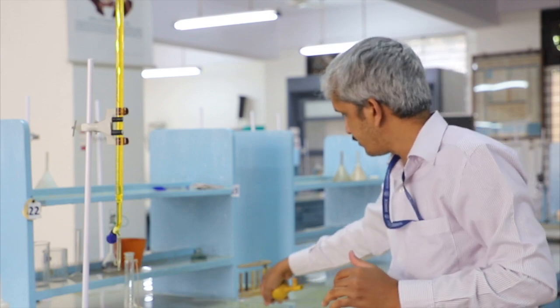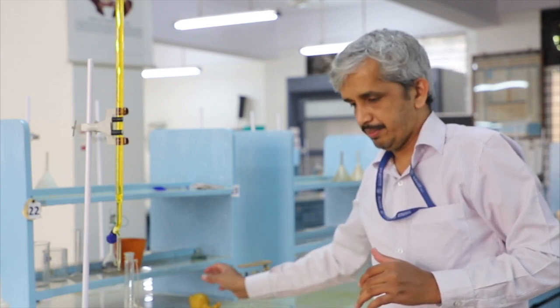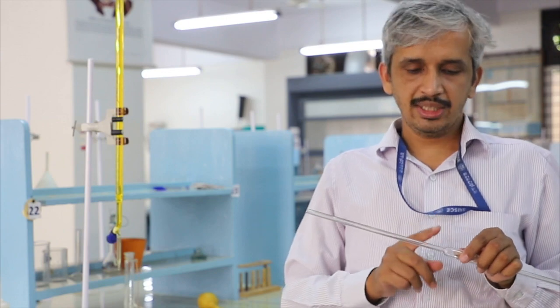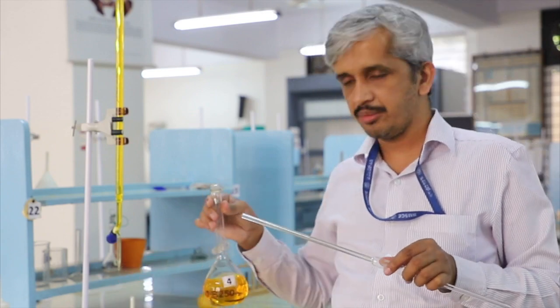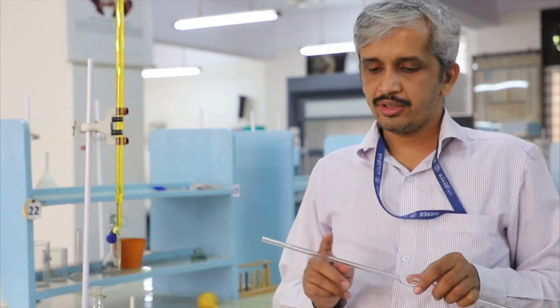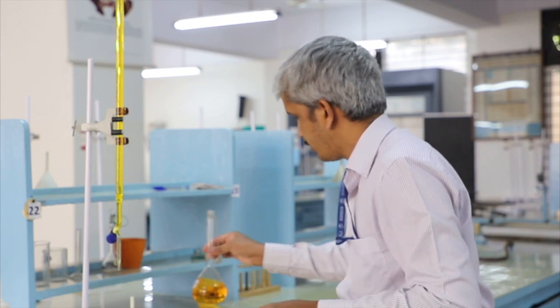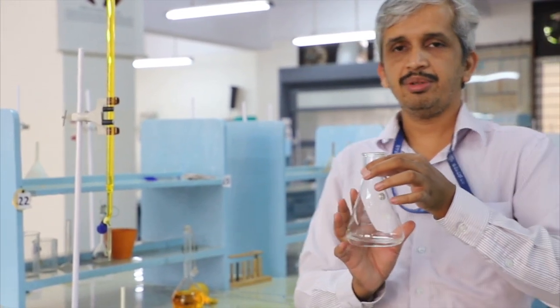Exactly the same thing can be followed for a 25 ml pipette. And the important thing in case of a pipette, the rinsing should be done with distilled water. Also, rinsing should be done with the solution to be taken. Let's say I am taking potassium dichromate in the pipette. In that case, it should be rinsed with potassium dichromate also, very similar to the buret. The important thing in case of the conical flask, the conical flask should be washed with tap water and rinsed with distilled water, but the conical flask should never be rinsed with the solution to be taken. This is the change in case of the conical flask.